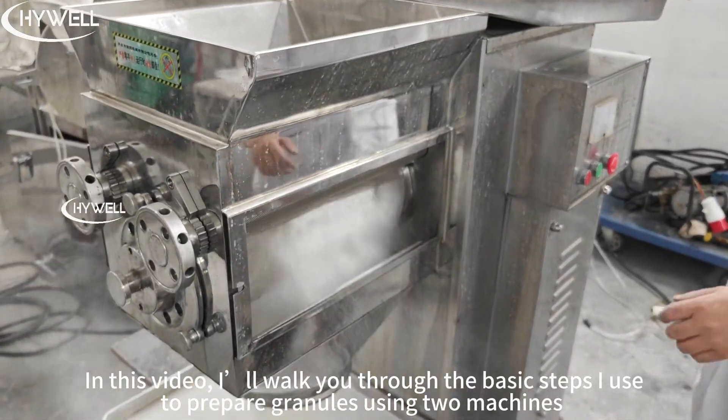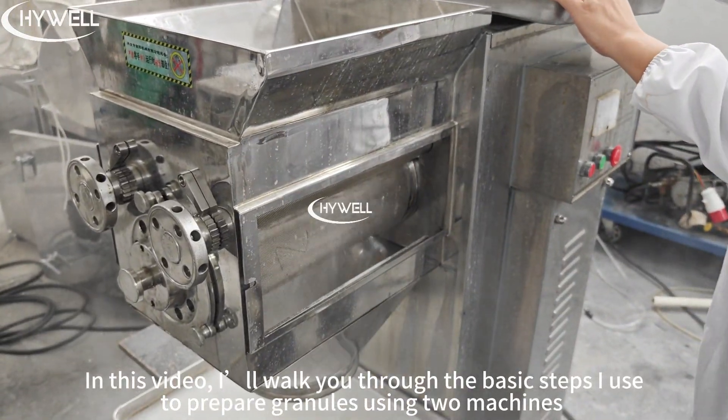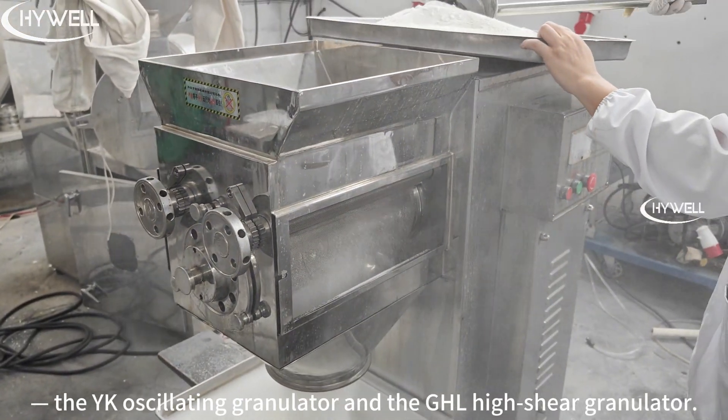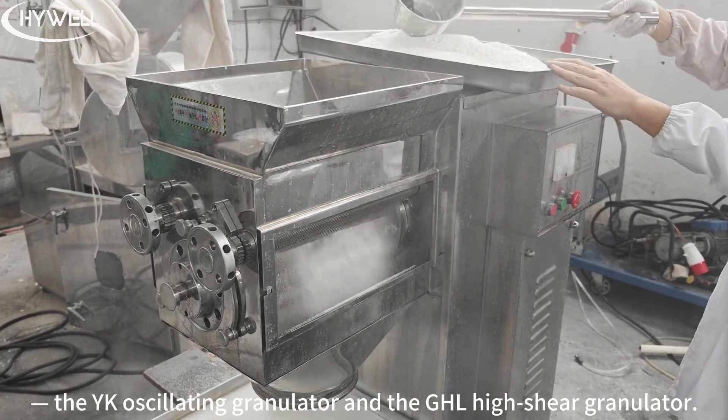Hey everyone! In this video, I'll walk you through the basic steps I use to prepare granules using the machines, the YK oscillating granulator and the GHL high shear granulator.